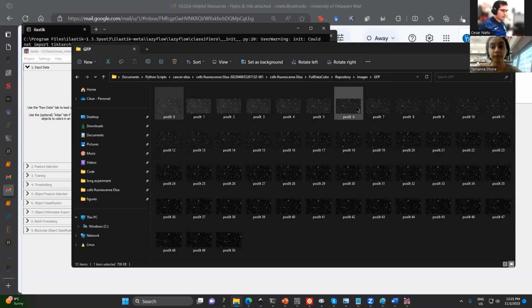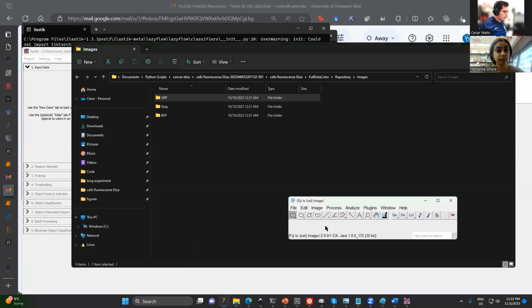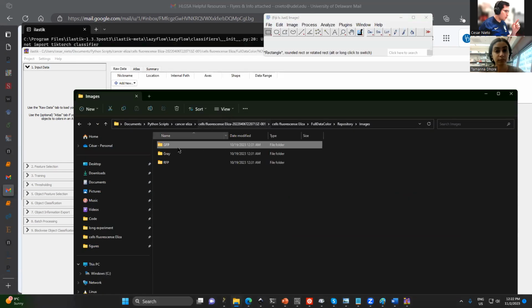Okay, you should have here 50. Oh no, okay, 50 figures. So let's make a stack. If so, I open image here, Fiji. I know you. Maybe you know how to use this, no? Yeah. Okay.